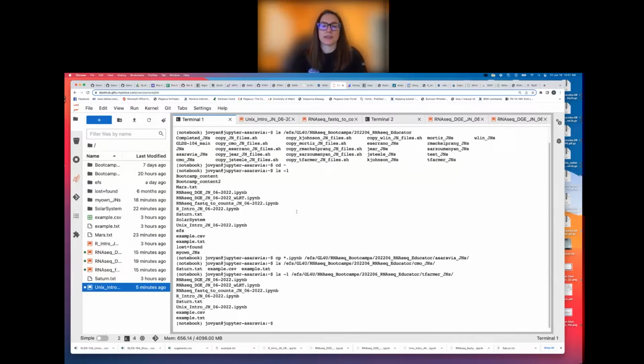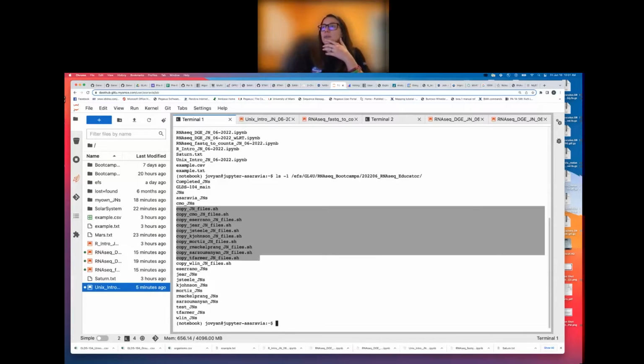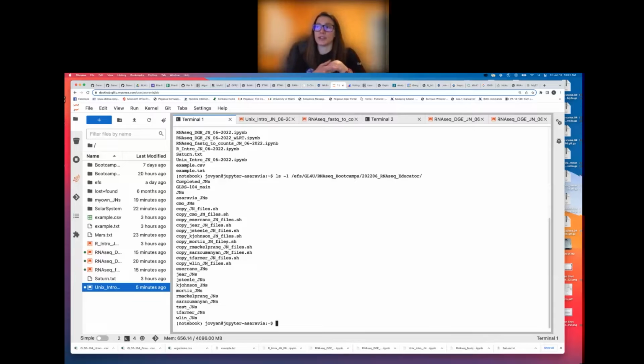You might have noticed when I did the list in that directory that's one up from your own directories, that there's a series of copy commands. This is the one that we did at the start to get all of the notebooks, as Lauren and I put them together, into your home directories. Now you'll also see a copy command for each one of you. That's the copy command that you're going to use for your students, in order to copy things from your directory, so your modified versions, into their home directories when you teach it.